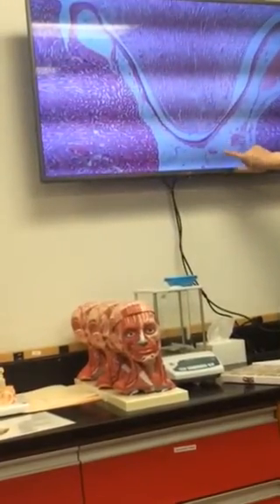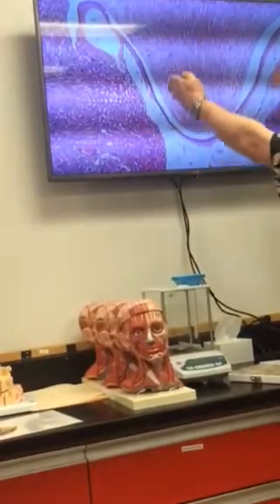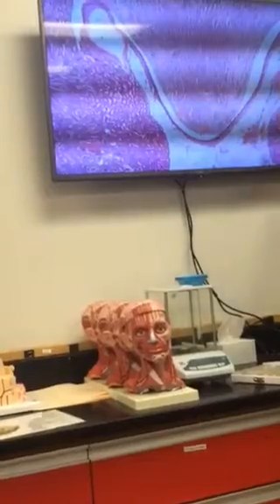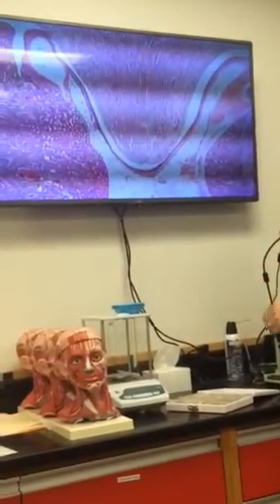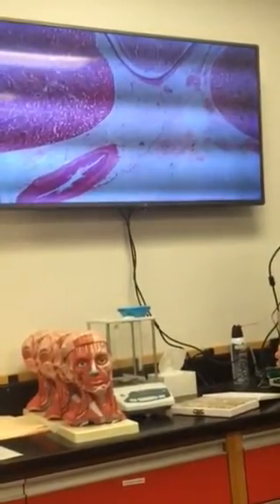And notice the fat tissue. There's a lot of fat tissue. And my suspicion is this would be the medial depression right there. That would be the hilus area, right? Even though I won't ask that on this, I'll ask it on the bigger model. But look at all the fat.